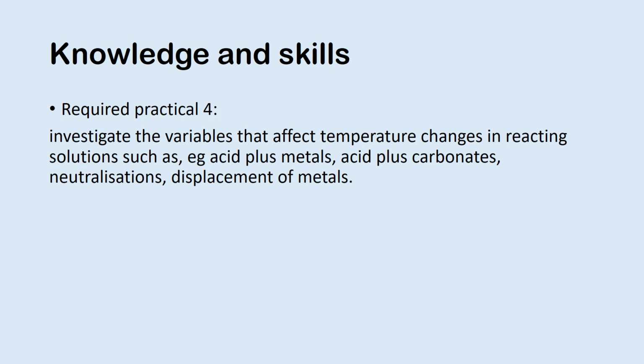Okay, so in this lesson we're going to be looking at required practical number 4. Specifically, this is what it says you're supposed to be able to do. It says investigate the variables that affect temperature changes in reacting solutions, such as acid plus metal, acid plus carbonate, neutralizations, and displacement of metals. Now, the one we're going to look at is neutralizations. However, clearly, you could have any of the other options there.